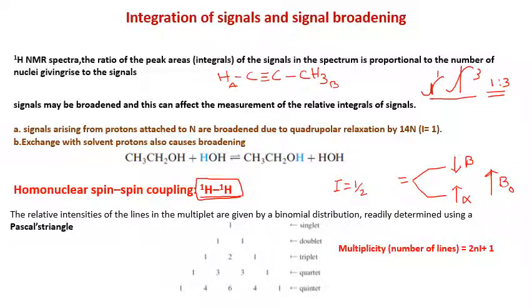The energy difference between the spin states depends on the applied magnetic field of the NMR spectrometer. So this energy difference is dictated by the external magnetic field; how much field you apply will vary the delta E value. For example, arbitrarily consider a molecule having an HA proton connected to another proton HB through chemical bonds, directly or indirectly, one bond away or more. Now HA and HB are magnetically non-equivalent, therefore they will give different chemical shift values, delta A and delta B.